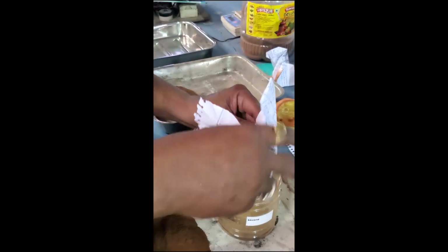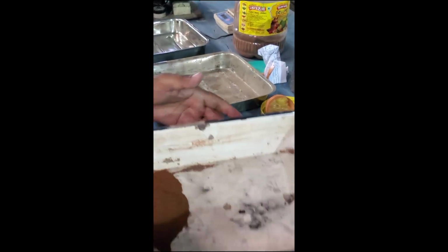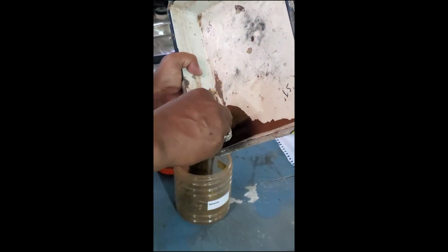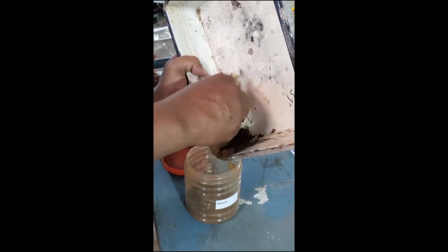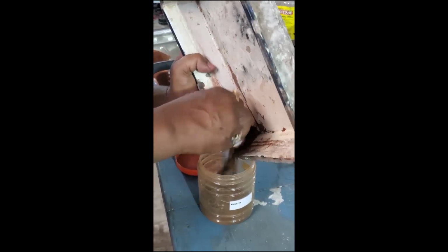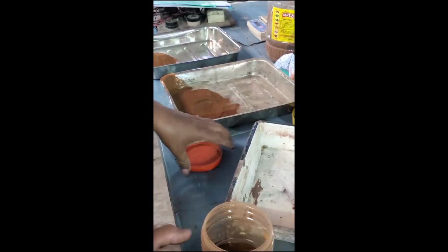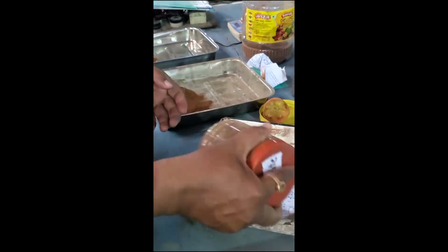This is the third tray. In this third tray we are adding 200 grams of iron ore and 2% of bentonite, that is 4 grams. In the same procedure we are taking it into one container. Close the lid, just shake it so that it will be properly mixed.